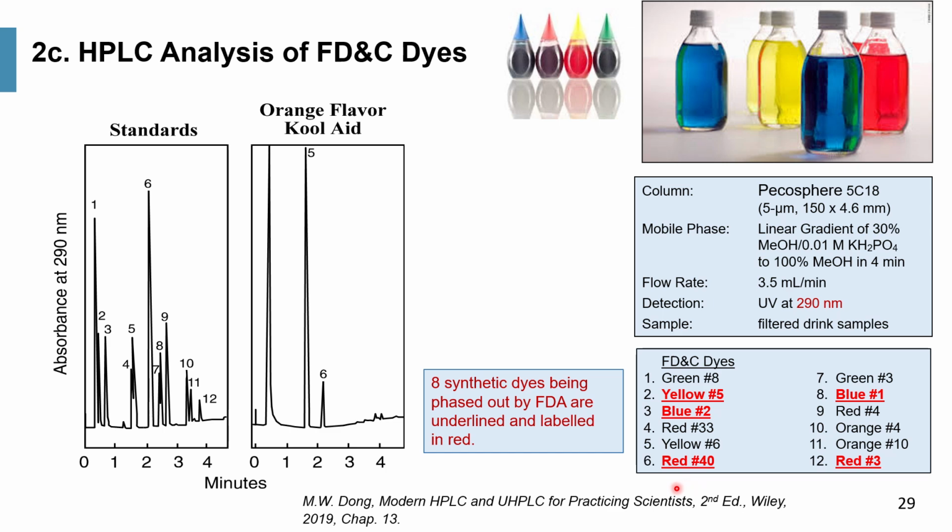So I did this application a while back, showing the quick separation in fast LC conditions of 12 FD&C food dyes. At that time, all these were allowable, but today several of them are shown to have some biologic activity and are in the process of being banned.